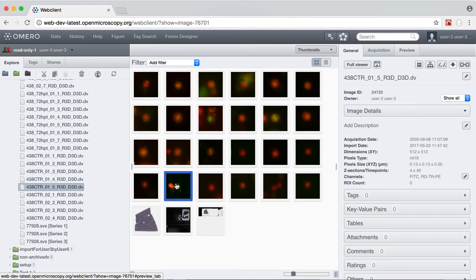Hi, we have a new web-based image viewer for OMERO called the iViewer and I'd like to show you some of its features.